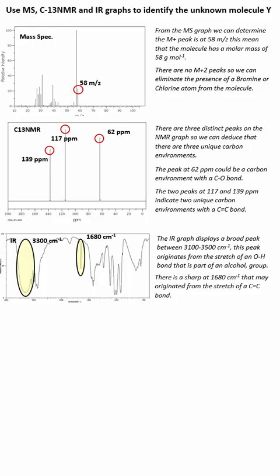So if we bring all this together, what we're going to try and do is take information from two different graphs to solidify the functional groups or the carbons that are present. If I was doing this for the spectroscopy achievement standard for NCEA at level 3, I would have to identify two aspects from each graph to pass, and then I would have to describe or explain those aspects from each graph and identify a molecule to get a merit.